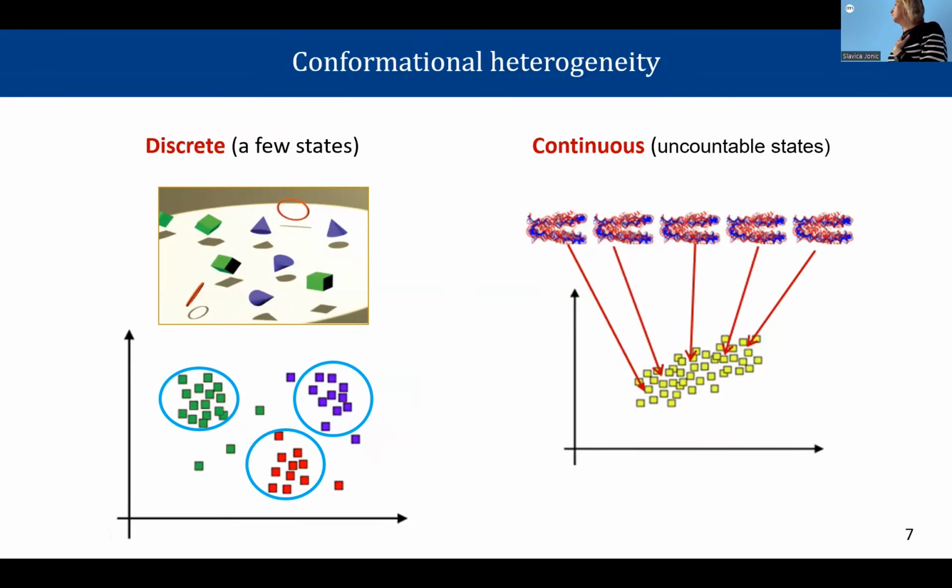And what we would like to get, I mean, this is really a schematic, is this kind of conformational space. This is something that we want to get: a projection of all these conformations onto some low-dimensional space. So different points, squares here, are different shapes, and the close points are similar shapes.